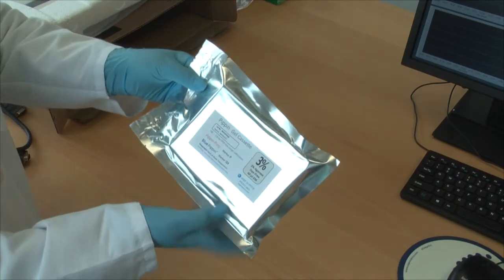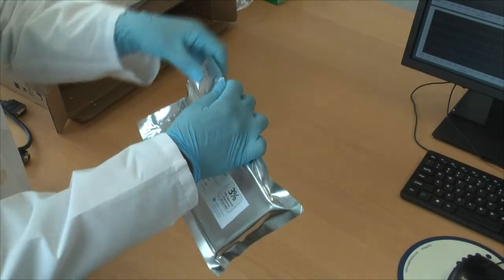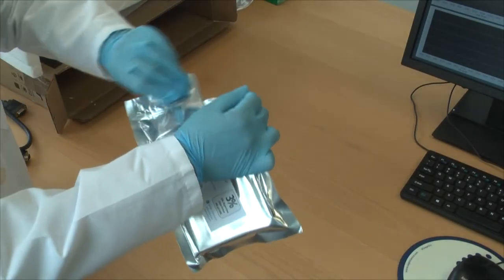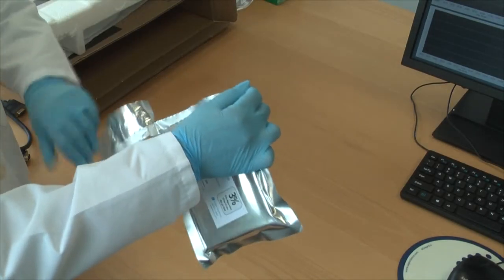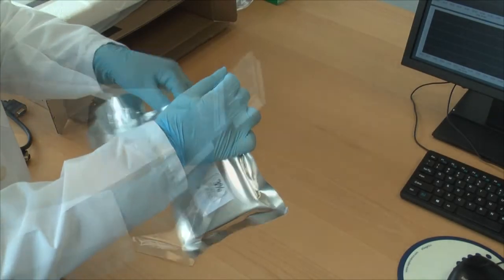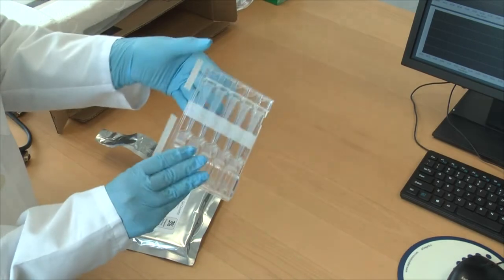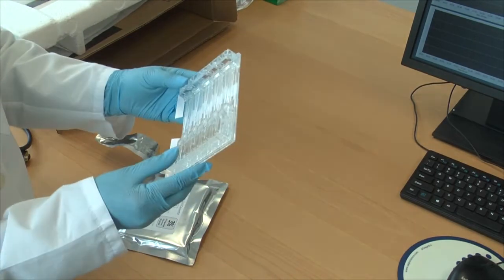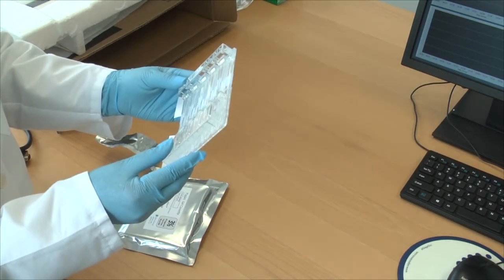The gel cassette is removed from its foil packaging and inspected for leakage, gel breakage, or delamination from the cassette body.